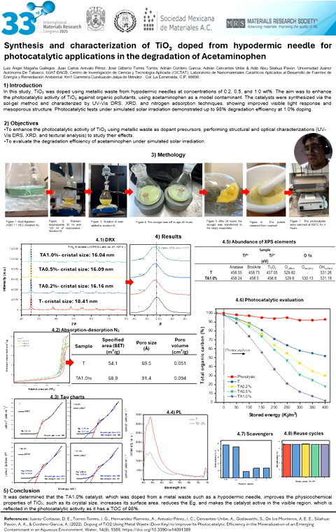In section 4.3, doped samples absorb in the visible region. Non-doped titanium dioxide absorbs only in UV. This is because it has a band gap of 3.2 eV and Ta1% has a band gap of 2.88 eV with a metallic band gap. We can see these band gaps in the Tauc graphic, meaning less electron-hole recombination.